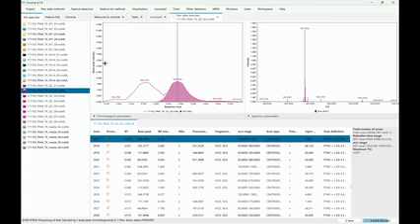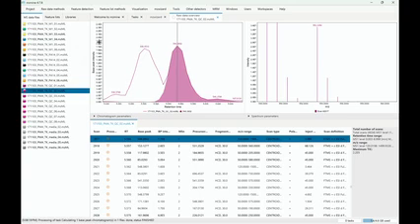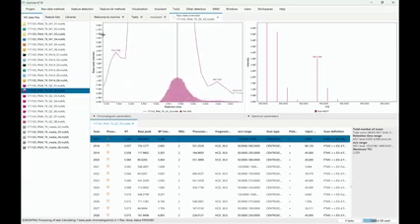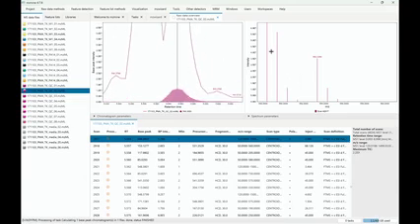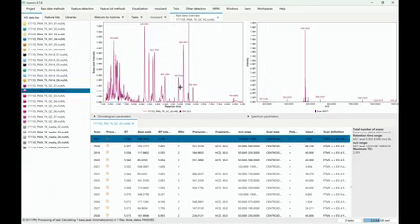Up to you. So in here, more things that we can do is we can also, of course, look at other signals, because if we click anywhere in the chromatogram, it picks the highest signal and shows the shape. And if we take one of the isotopes, it should have the same shape, right? That's basically one analysis that we can do. I click in the spectrum, get a different mass already visualized. I can click on other masses and see maybe they're a little bit shifted. And I can look at the peak shapes.